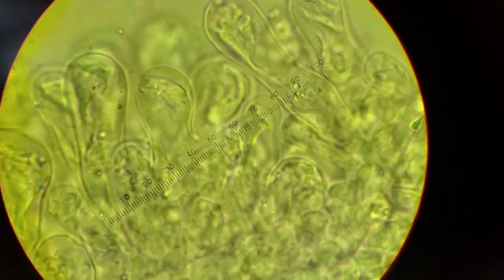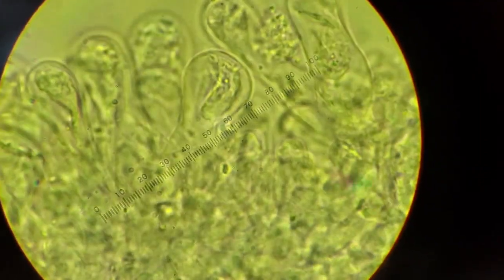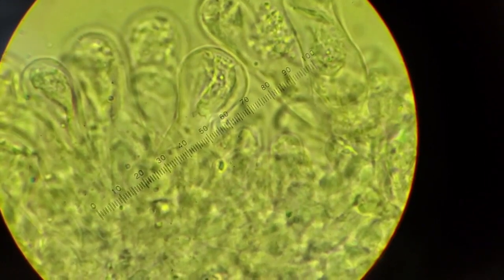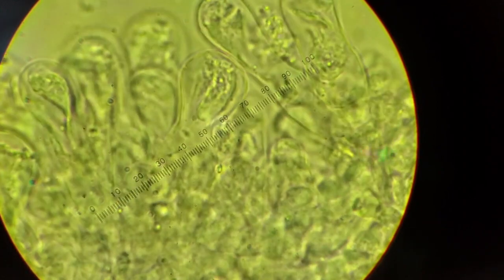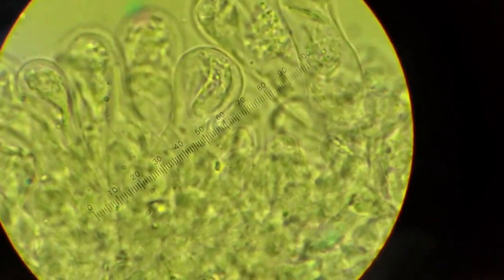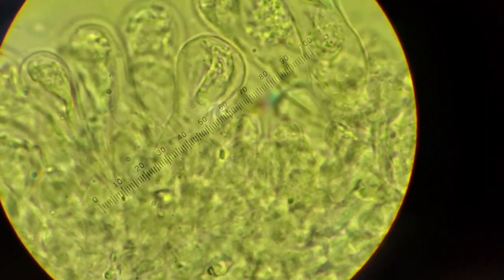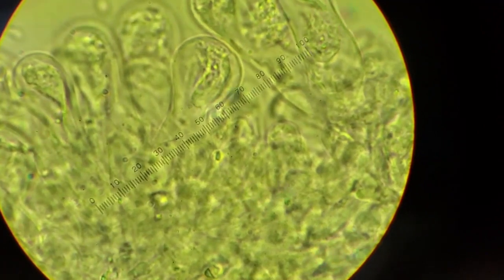So this is what a squash mount will give you, this ability to see cells as if they had been dissected or separated from each other, when a gill section isn't going to necessarily give you all of those features that easily. It can, but it requires a lot more repetition and tries, whereas a squash mount will give you at least the basidia and basidioles and any other ornamentation on the cell surface, or if there are pleurocystidia or cheilocystidia, you'll probably be able to measure them a lot better.